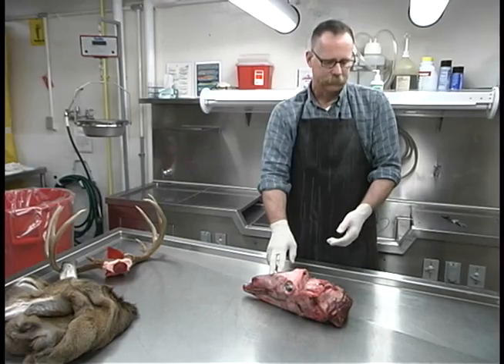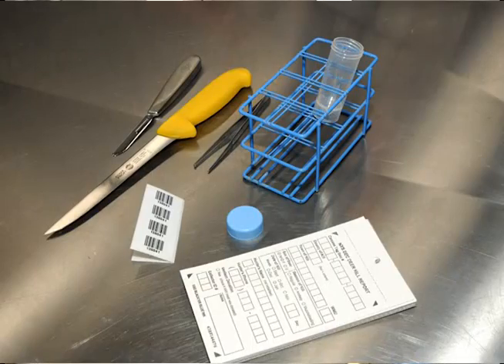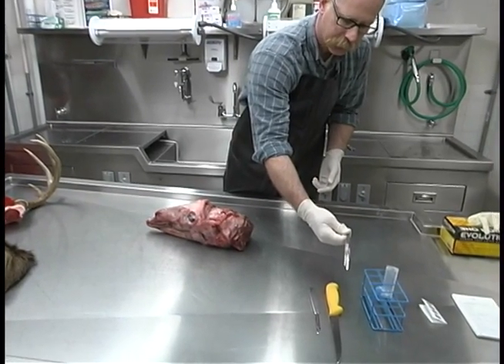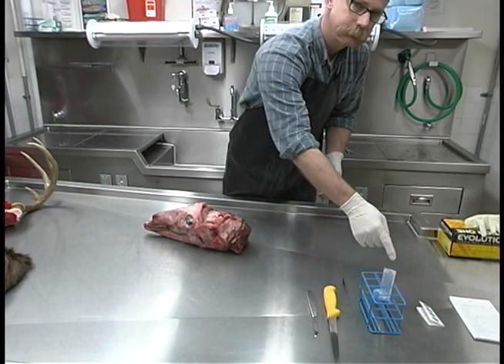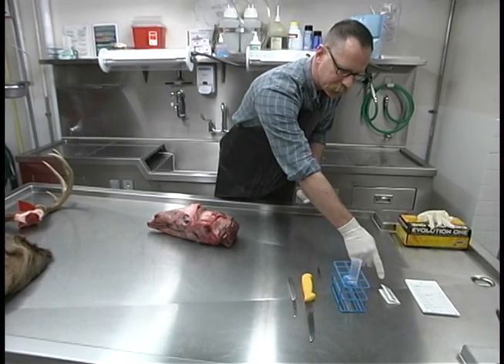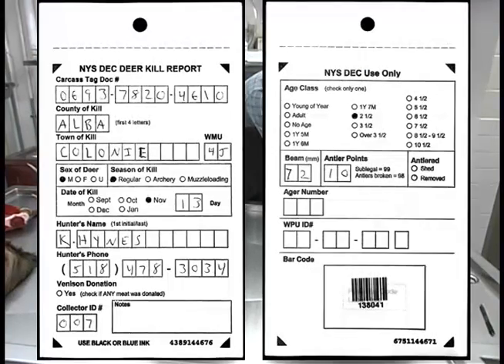In addition to a deer head you'll also need some tools: a sharp knife or scalpel — I prefer a scalpel — toothed forceps or tweezers to get a grip on the lymph nodes, a clean sample tube, and numbered barcode stickers to go on the sample tube.